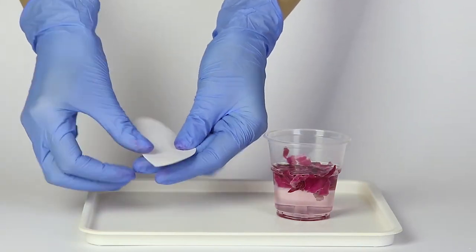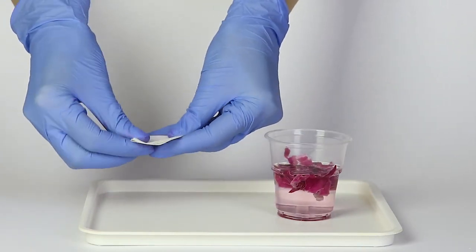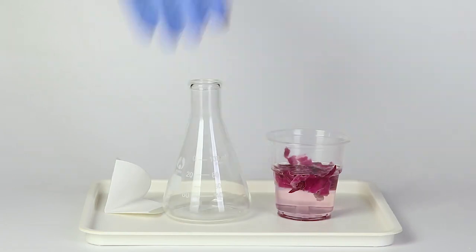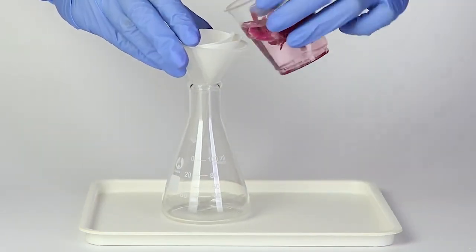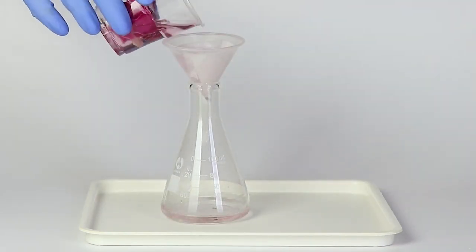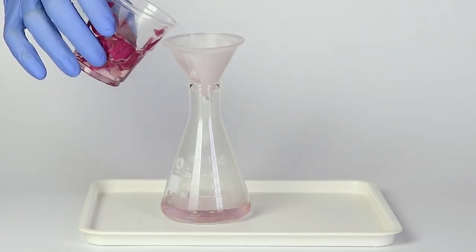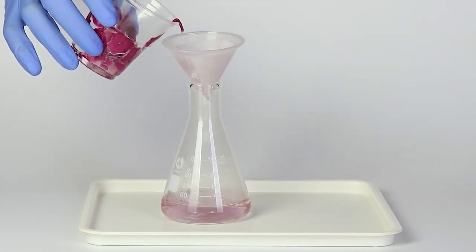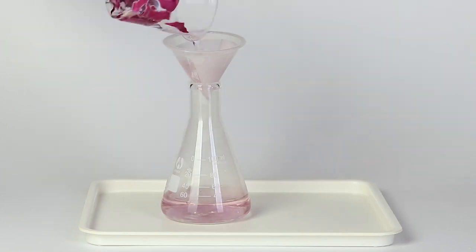Take the filter paper and fold it as shown in the video. Now take the flask and put the funnel into it. Then put the folded filter paper into the funnel. Gradually pour the solution out of the disposable cup into the funnel to filter out the petal fragments.